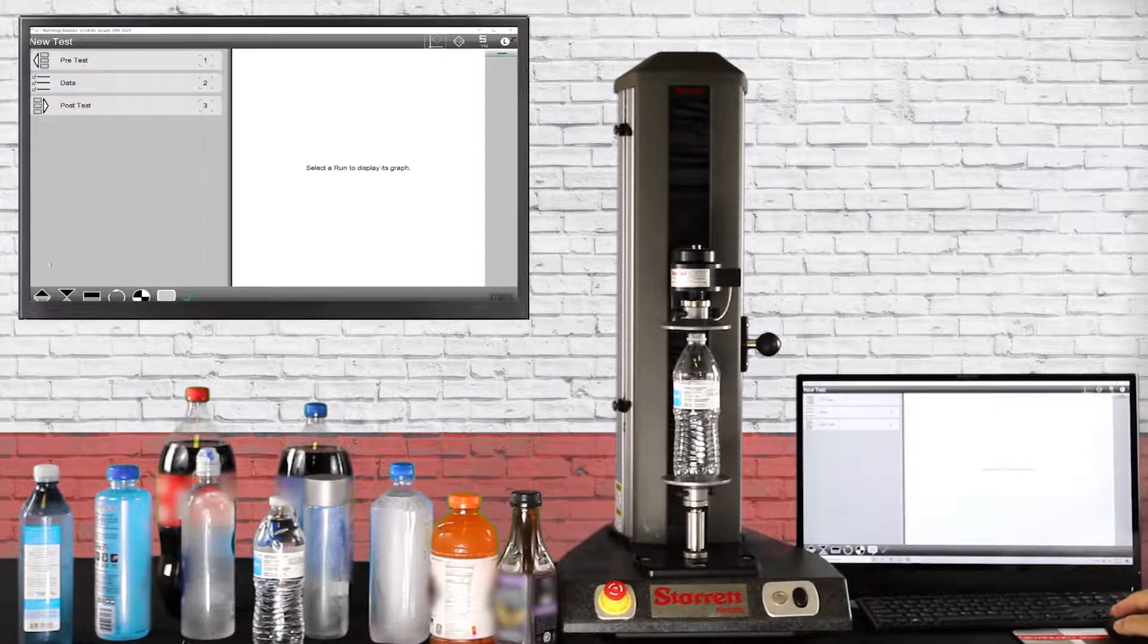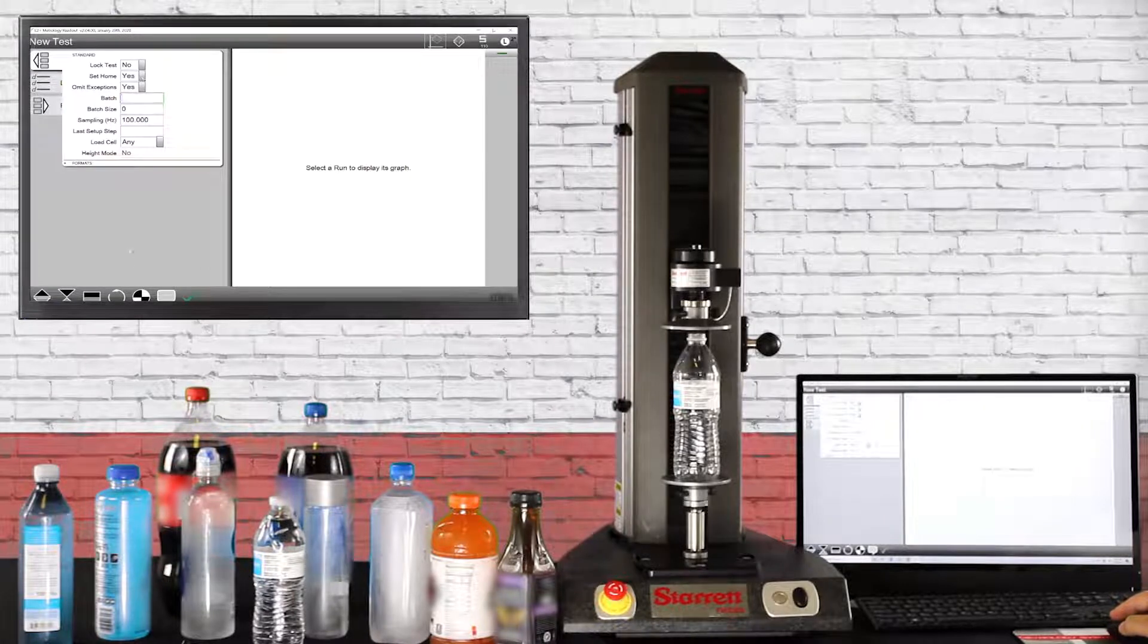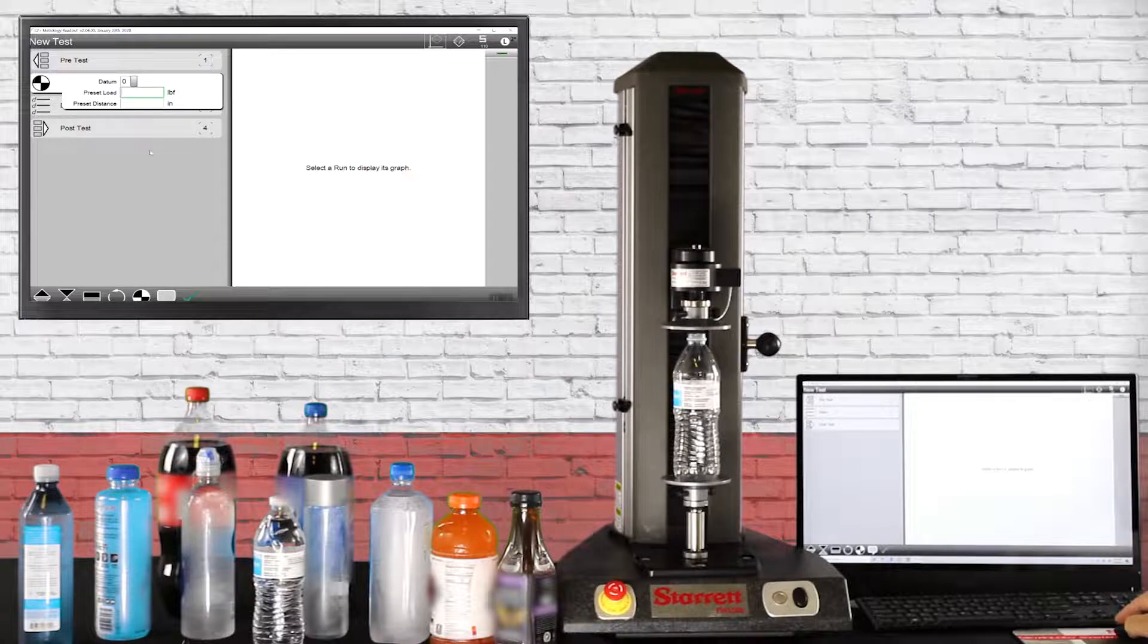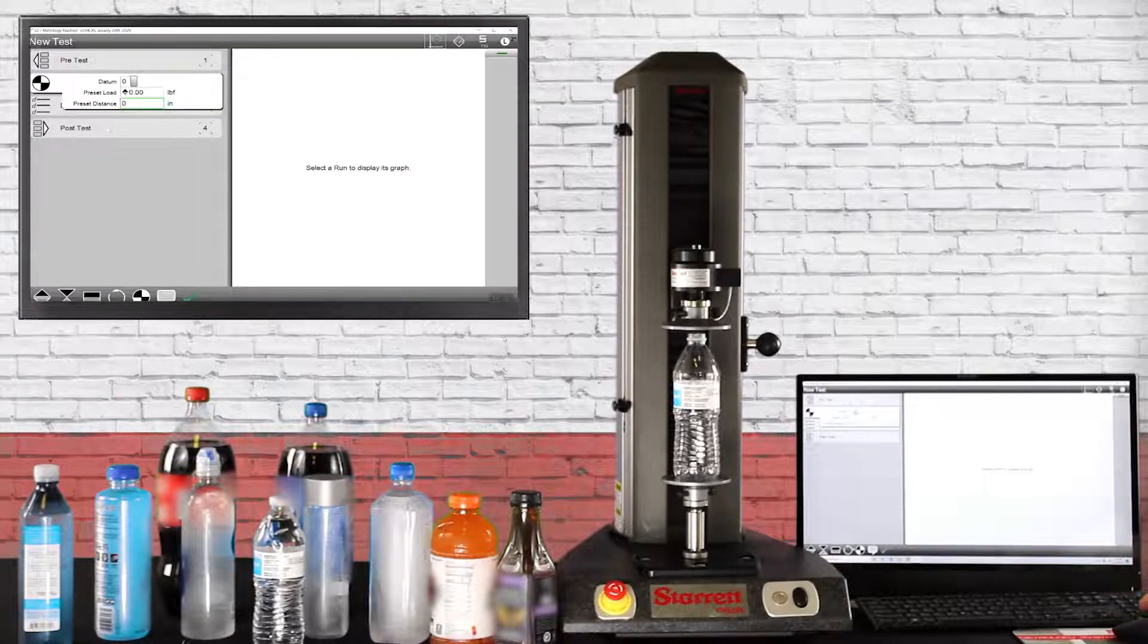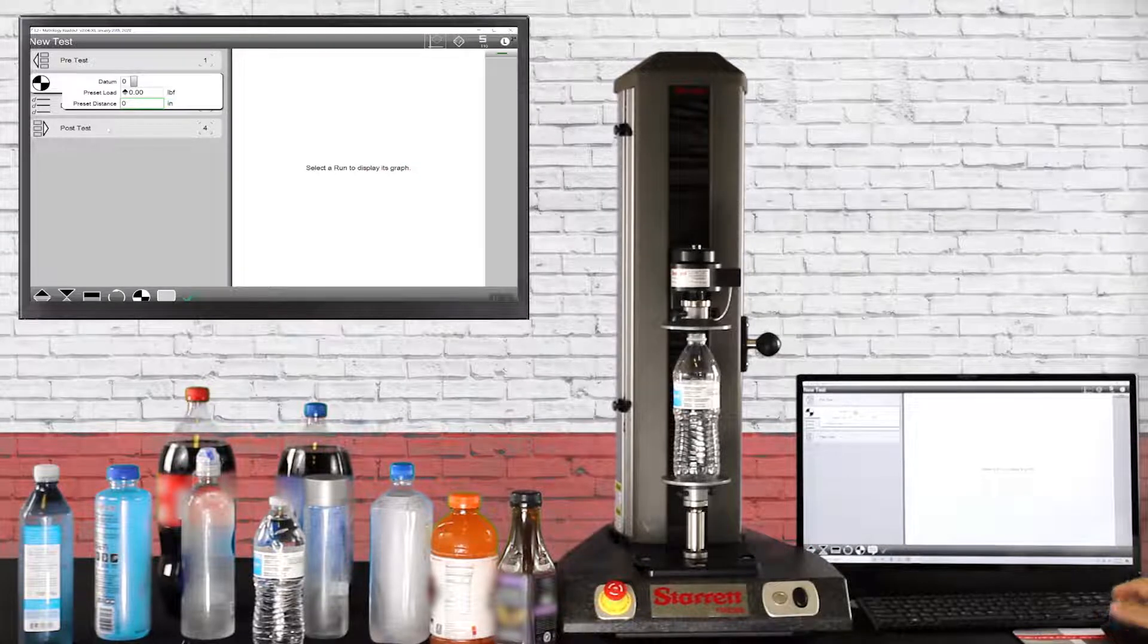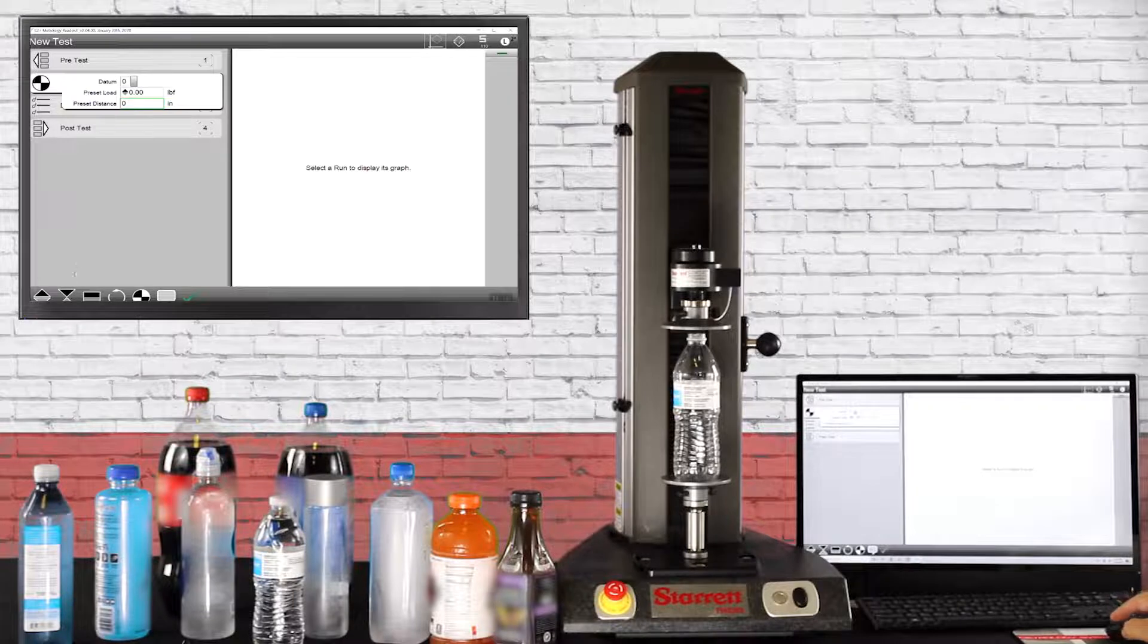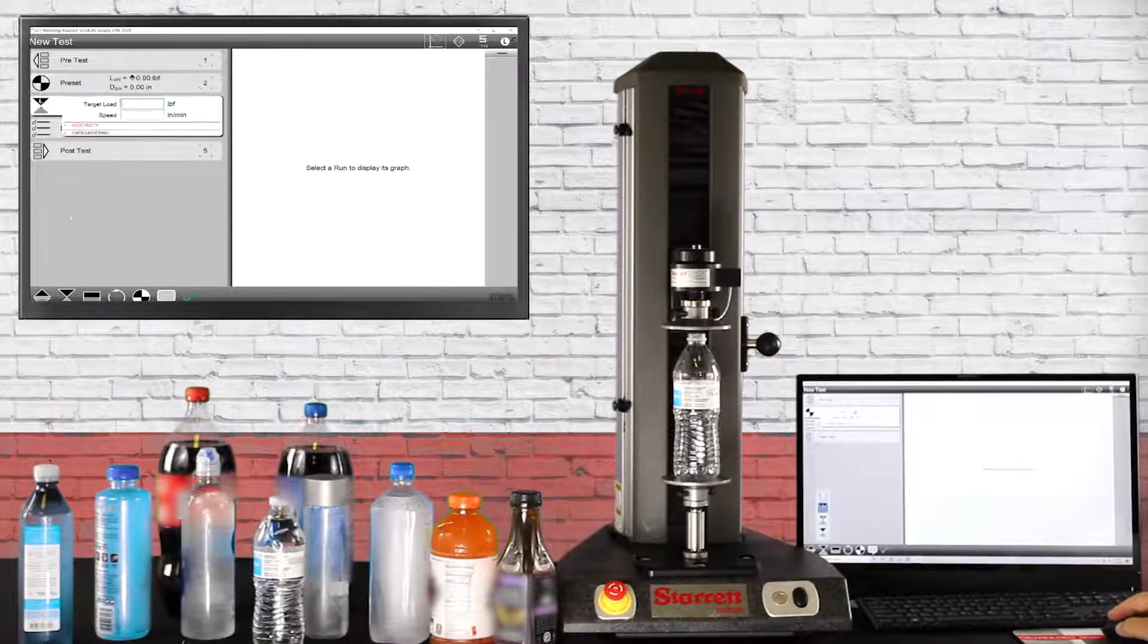We create a new test, go into pre-test, and set our home position. Then we go down to the data and create a datum, our primary datum which would be datum zero. We put a zero there for load and zero for distance.